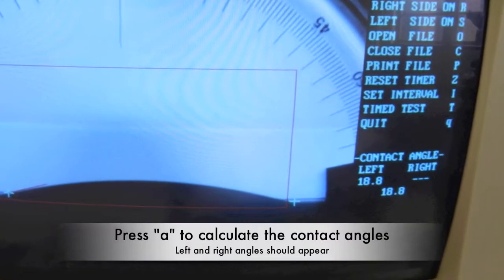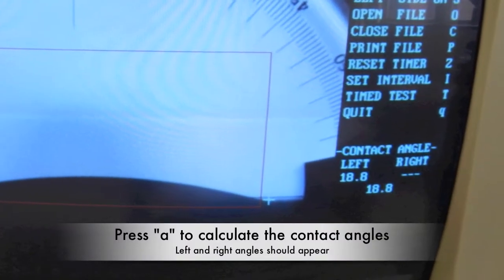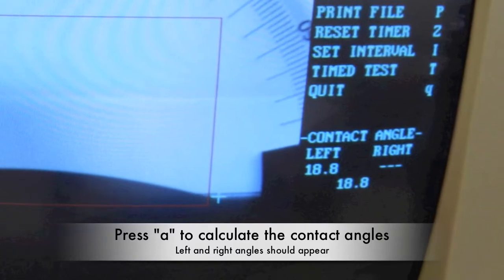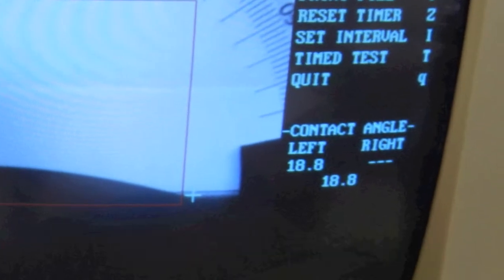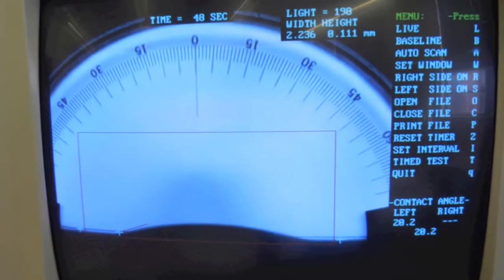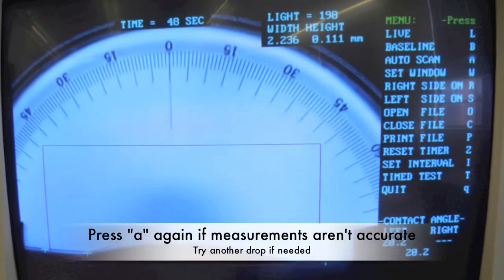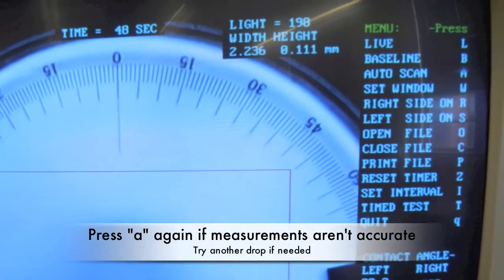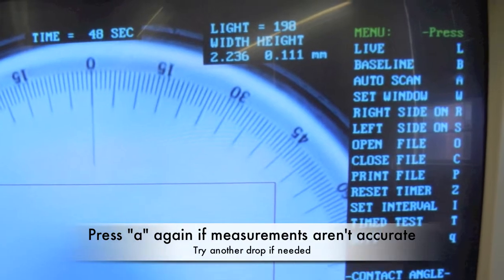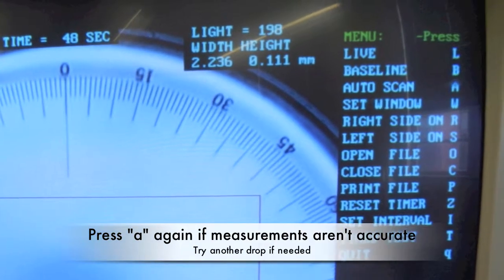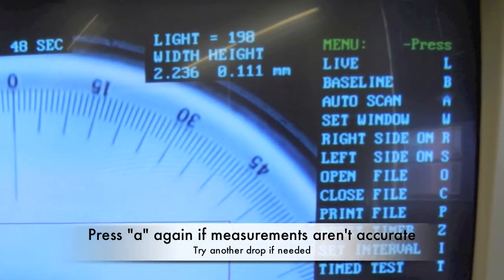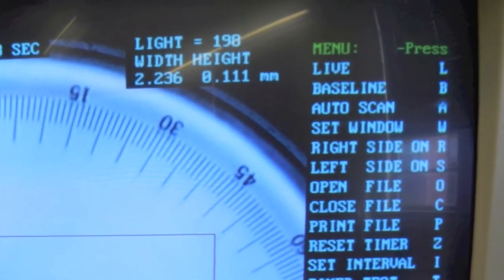Press A to calculate the contact angles. An image will be taken and two contact angle measurements should appear. If the measurements don't appear or are clearly inaccurate, press A again. If you are continually having difficulties, you may need to re-establish the baseline or try another drop.